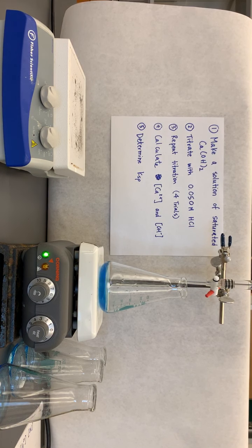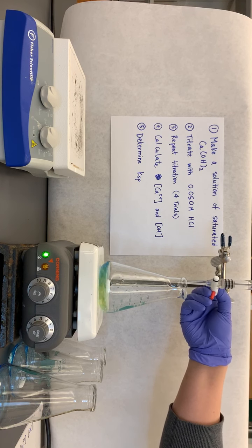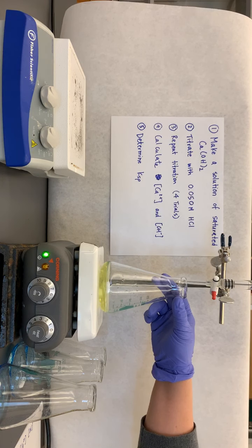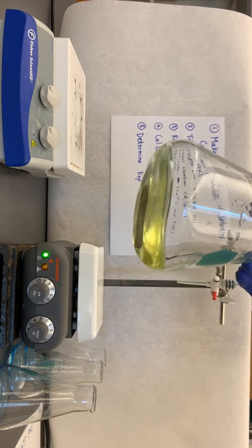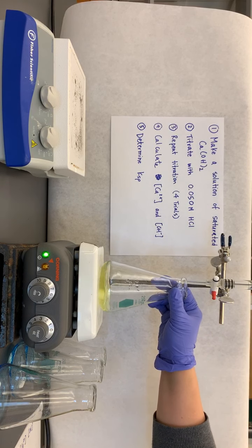Okay, so I've got it adding dropwise, and we're looking for a color change. Okay, so right there you saw the color change. It was blue. Okay, now it's this yellowish color. Okay, looks like one of those Gatorade flavors.